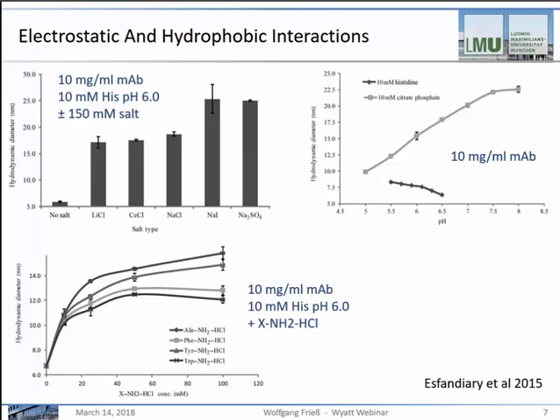The antibody itself does not increase in hydrodynamic diameter, but larger clusters form from the hydrodynamic diameter of the antibody of about 6 nanometers.